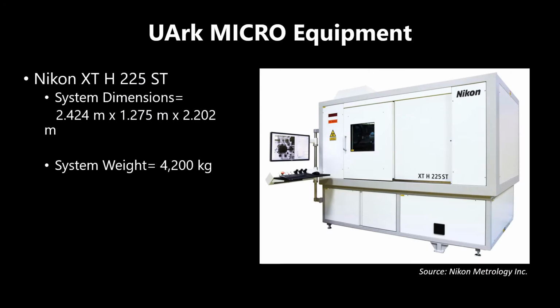The MicroCT equipment we have at the University of Arkansas Micro Facility gives us considerable flexibility in the size and density of objects that can be scanned. The specific system at the heart of Micro is a Nikon XTH225ST, which is a large cabinet-sized system.